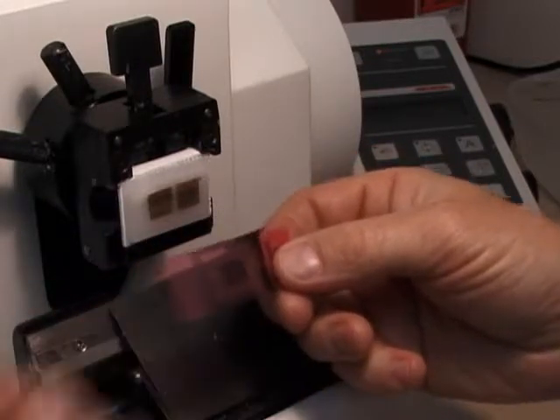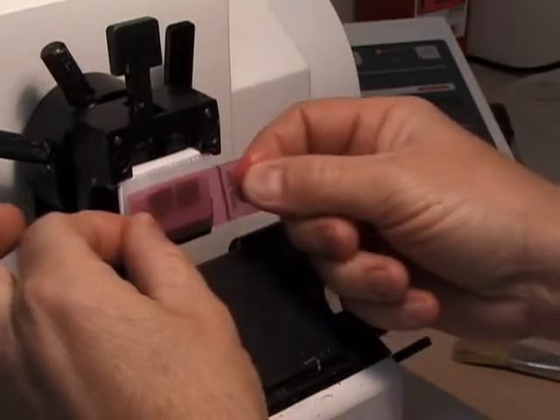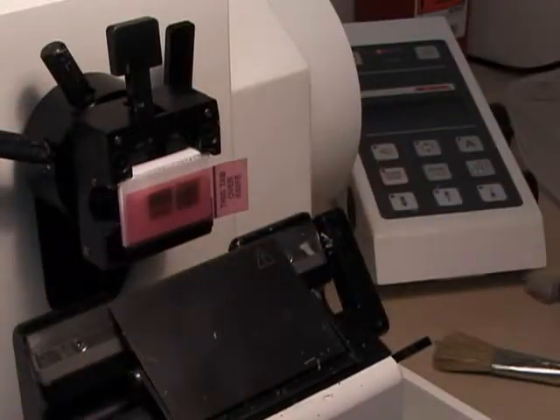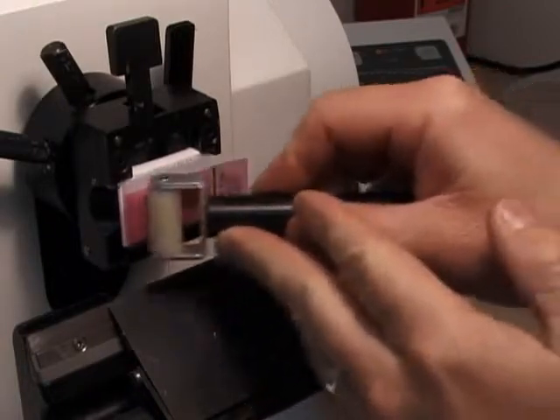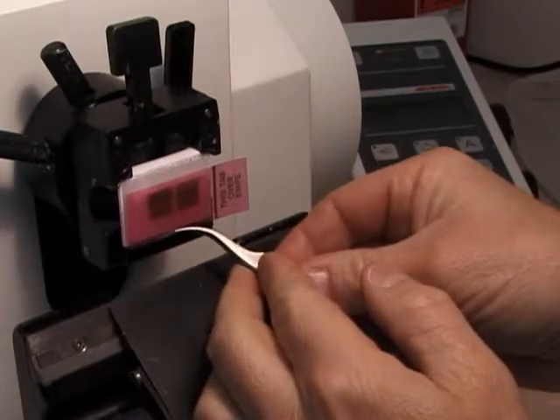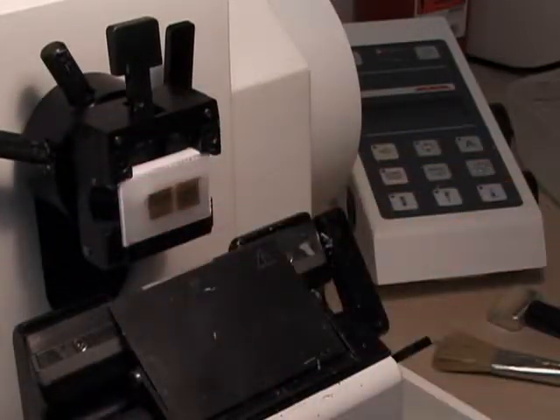To get the tape to stick to the block, remove the tape's plastic coating. Stick the tape to the block, trying not to get any air bubbles between the two. Use the roller to flatten out the surface. Grab the tape with a pair of forceps and with one clean motion, make a section. This may take some practice getting used to.